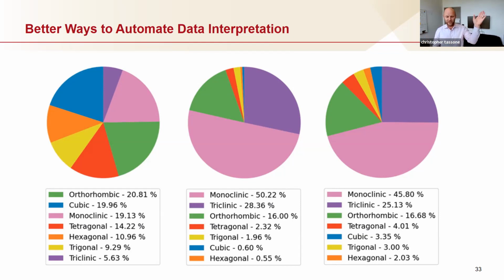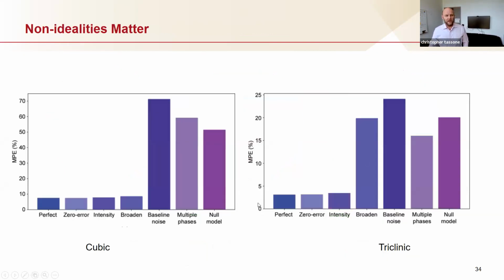And I was adamant. There have been a number of papers that showed if we train on simulated data, it simply doesn't work. And he said, "Let me just try." And so he went and mined the data in all the crystallographic structural databases, which is close to about 1 million CIF files and powder X-ray diffraction patterns. This is what the representation from the 3 databases that we pulled from looks like. And then we looked at how we can start to account for non-idealities.